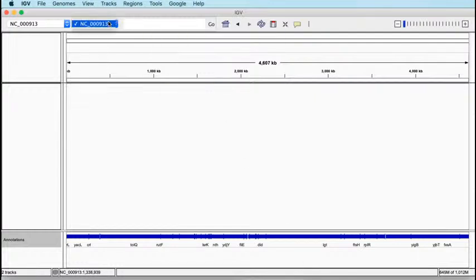No chromosomes in this case, or one chromosome in this case, because as we saw from the reference genome when we downloaded it, it's just the chromosomal DNA of the bacteria, so we don't need to concern ourselves with plasmids and so forth in this instance.